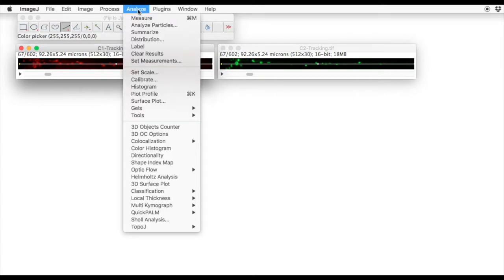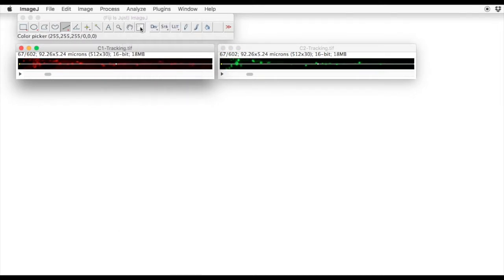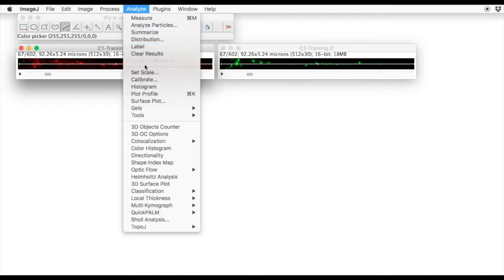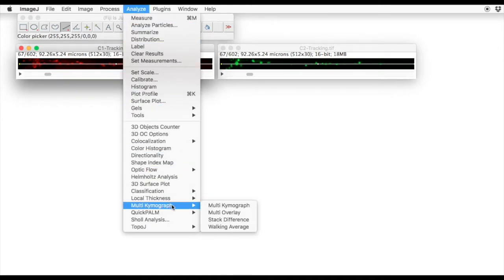We can then go to Analyze, Multi Kymogram, and select the Multi Kymogram option.